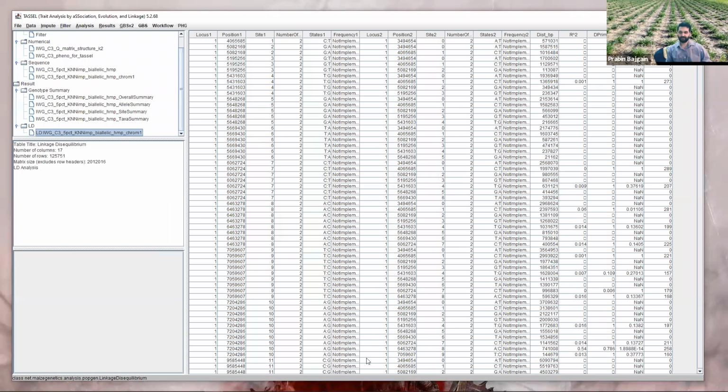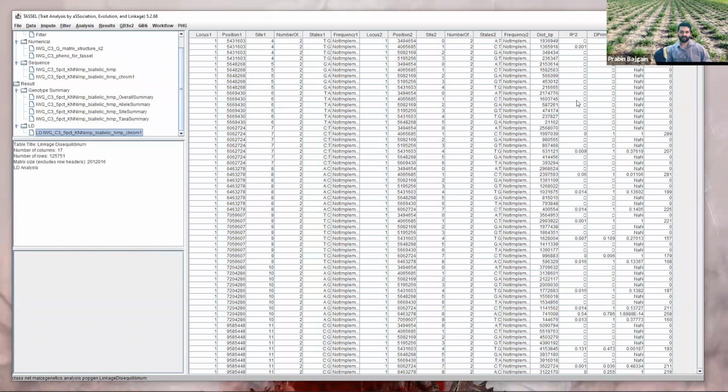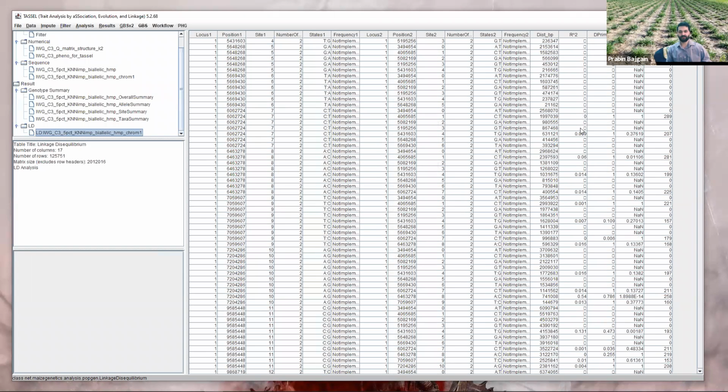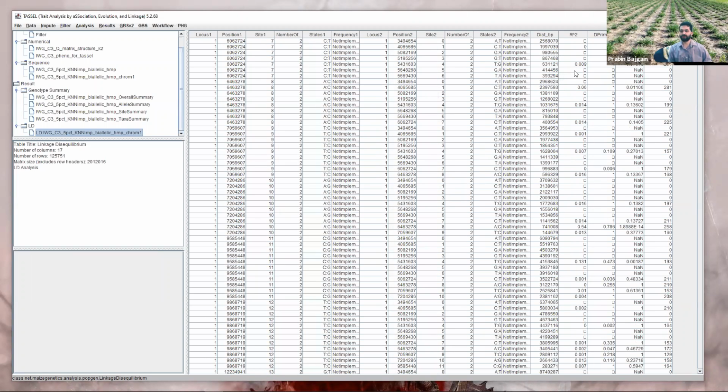One thing you will notice here is there's a lot of these NaN values and these square blocks that it could not calculate. These you will want to filter out, and it's much easier to do in R or even in Vim. There's a one-line command to throw those out, so you have only the meaningful numbers in your output file.